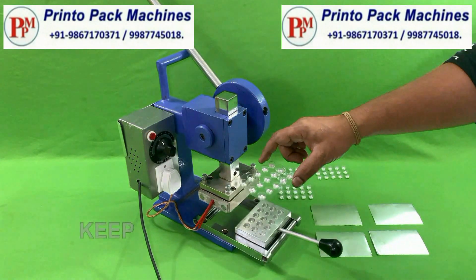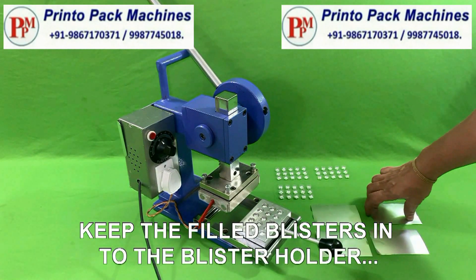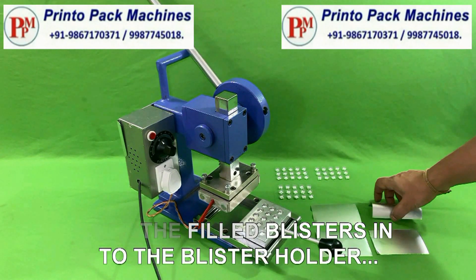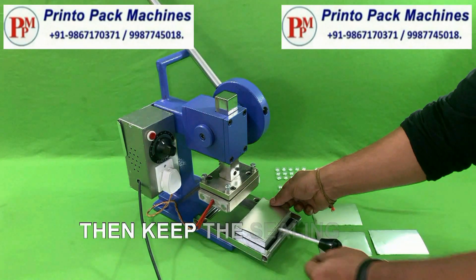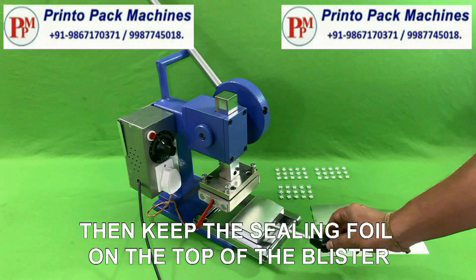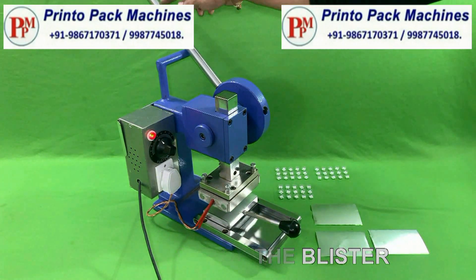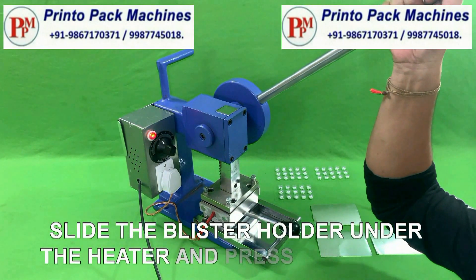Keep the filled blisters into the blister holder. Then keep the sealing foil on the top of the blister. Slide the blister holder under the die heater and press the handle gently.